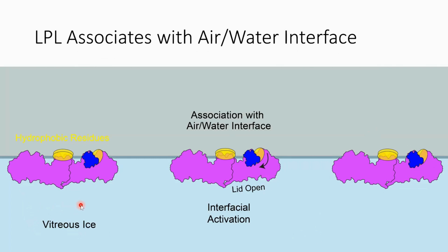And so this set off some light bulbs in my mind, because I realized that the air-water interface in some ways is very similar to the hydrophilic-hydrophobic interface that LPL would interact with when it finds a triglyceride-rich lipoprotein. So in its association with the air-water interface, the hydrophobic residues of LPL were associating with this transfer from hydrophilicity to hydrophobicity. And indeed, that could explain why we saw the lid in an open position having undergone interfacial activation if LPL was interacting with this air-water interface as though it were a substrate mimic.